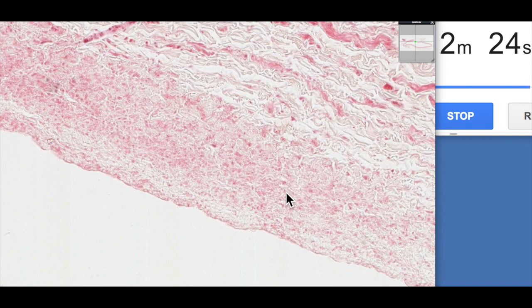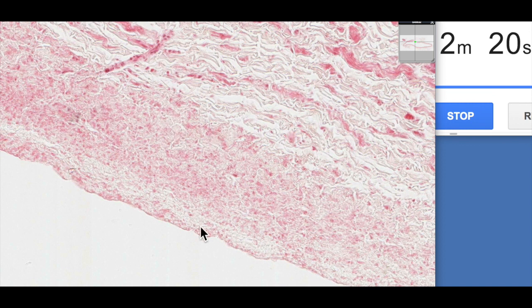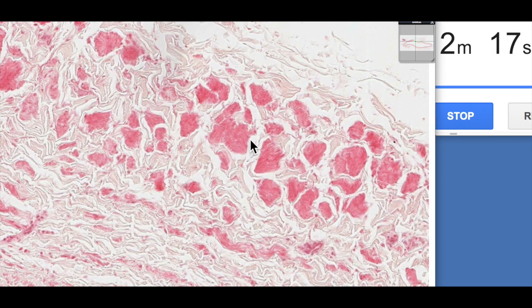It's sort of this randomly dispersed smooth muscle amongst connective tissue and then if we go to outside here, this is in the tunica adventitia, we've got these thick bundles of smooth muscle which is really different.